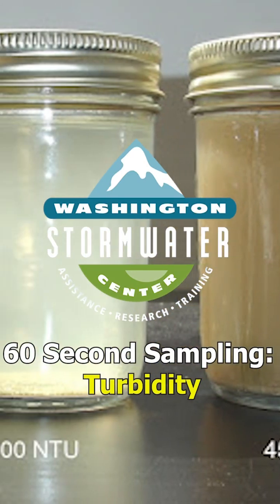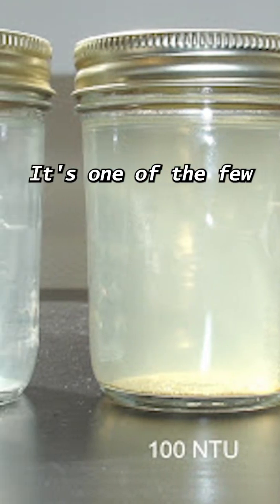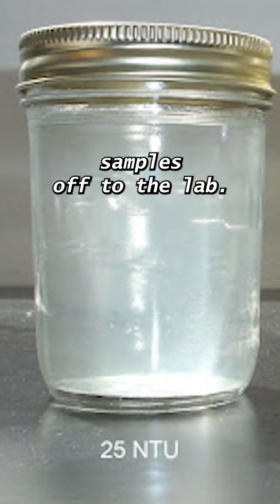Turbidity is the cloudiness of your stormwater, often caused by sediment. It's one of the few parameters that we can measure in-house without sending samples off to the lab.